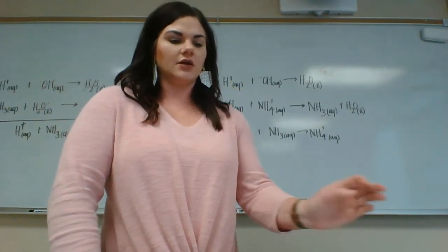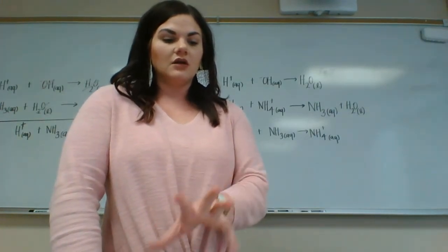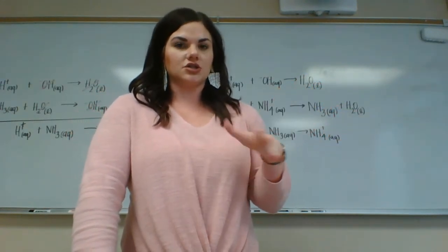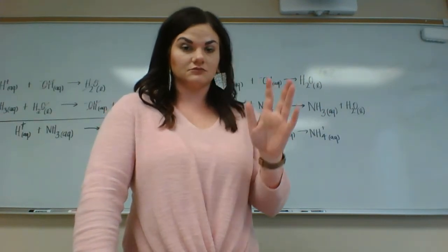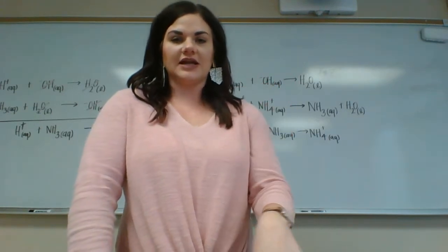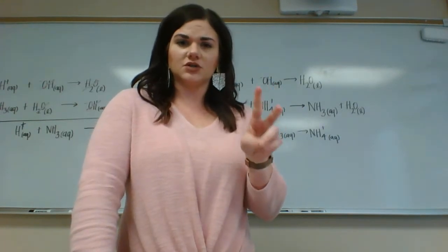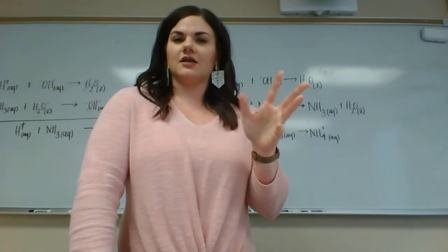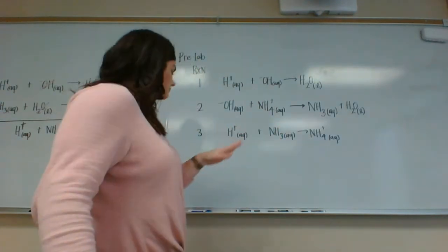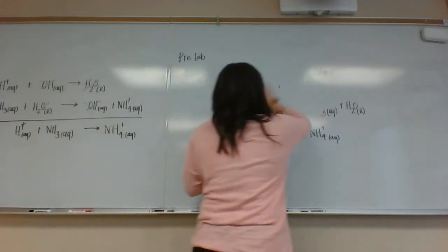Okay, so then we get to our data sheet. The only thing that you're actually getting in lab are your change in temperatures. That's it. And it's not hard. I think where you're going to struggle the most is the data analysis. And I was looking at old videos, and it really looked better when my notes were done. So I'm really sorry. They would have been done had I known I was going to have to do this video, because y'all know I talk with my hands. Okay, so let's look at the data sheet.